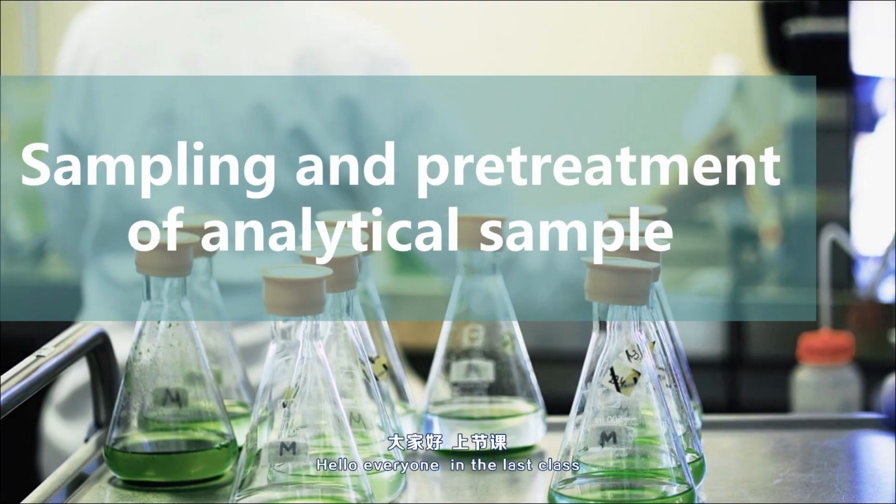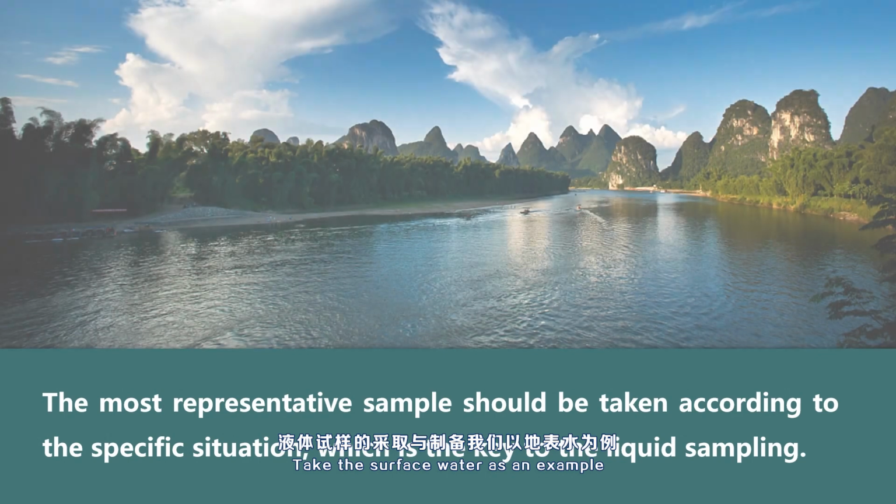Hello everyone. In the last class, we introduced the sampling and preparation of solid samples with the example of ore, soil, and matter. Today, we will continue to introduce the sampling and preparation of liquid samples. Take the surface water as an example.